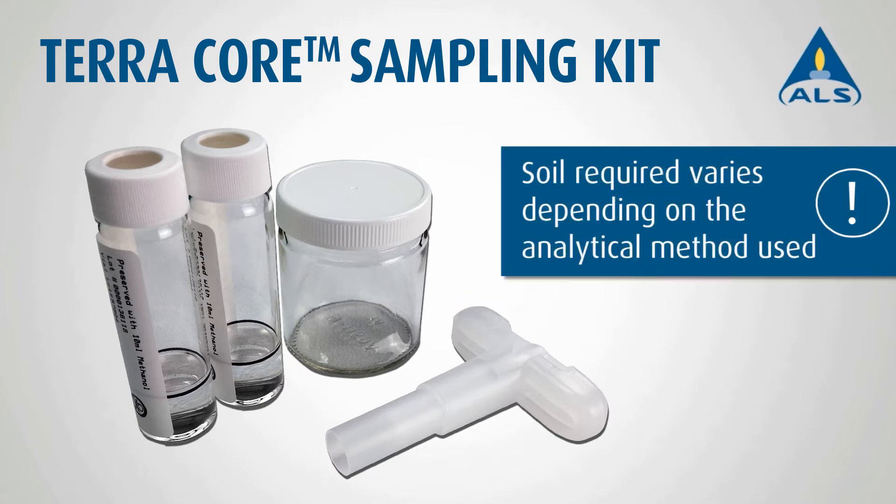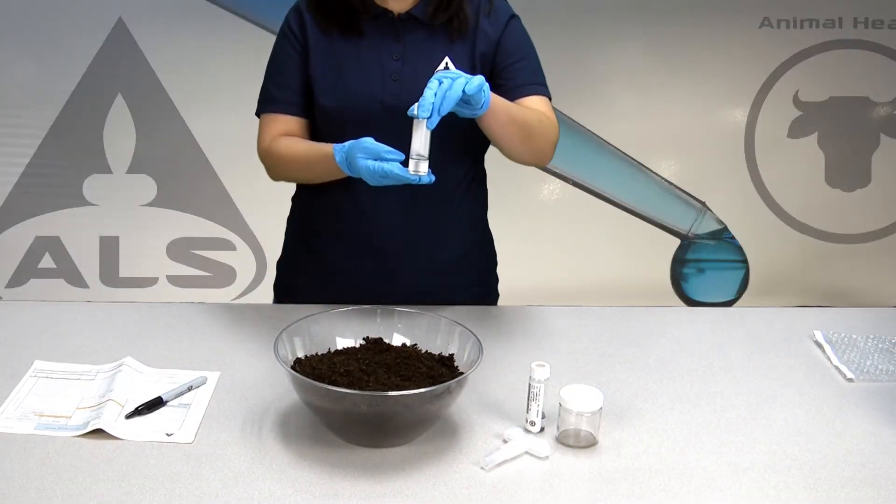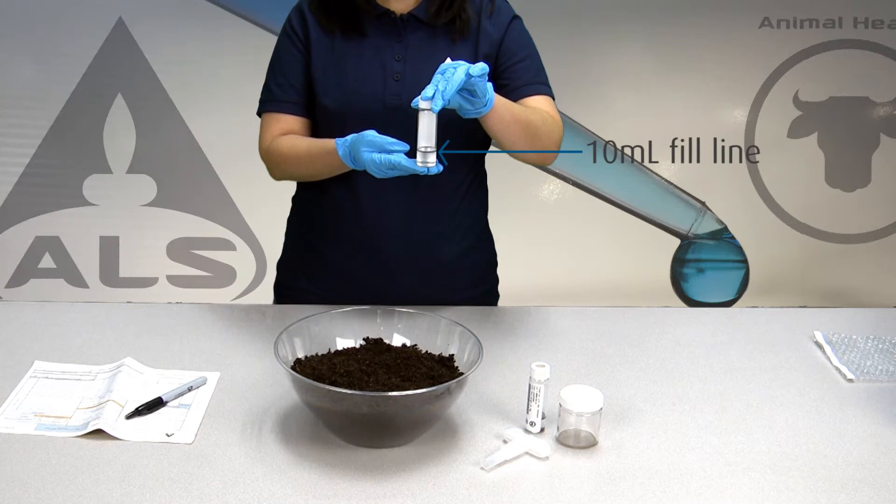The methanol to soil extraction ratio is important for the analytical method. If you are unsure of the amount of soil to meet your required reporting limits, please contact your ALS Account Manager. Before sampling, check the black 10 milliliter fill line to ensure the methanol volume is correct.